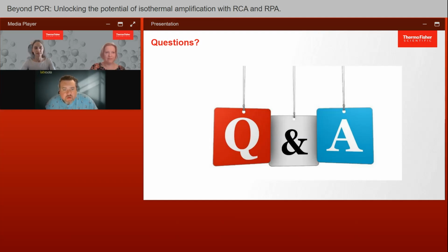Okay. For Rasa, how many regions in human genomic DNA can be designed for the multiplex PCR reaction?